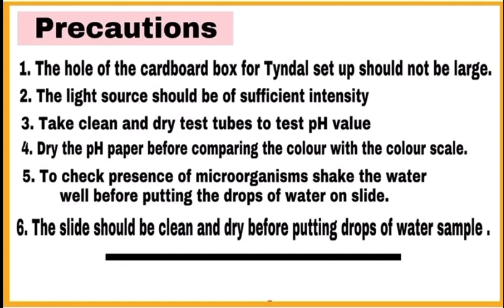5. To check presence of microorganisms, shake the water well before putting the drops of water on the slide. And 6th, the slide should be clean and dry before putting drops of water sample.